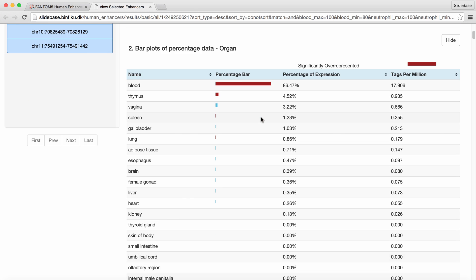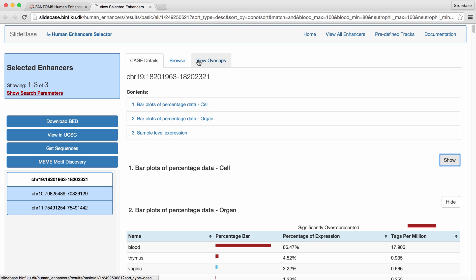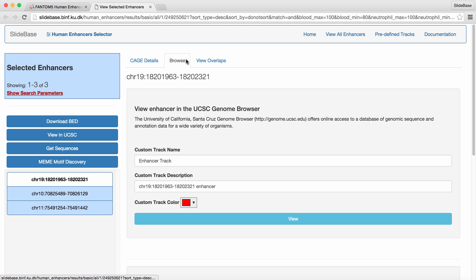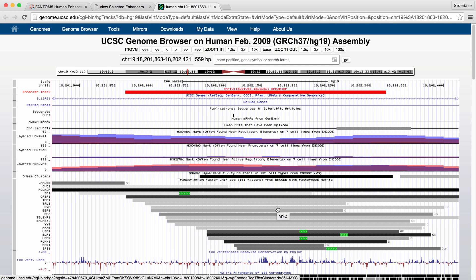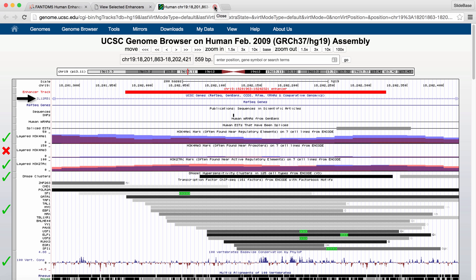In the second tab, we have the option of viewing our enhancer as a track in the UCSC Genome Browser. We will keep the default values for the enhancer track and click on the View button. In the UCSC Genome Browser, we recognise some of the enhancer properties: H3K4 monomethylation and H3K27 acetylation marks, but not H3K4 trimethylation marks; DNase sensitivity; a number of ChIP transcription factor peaks; and it is also slightly conserved. Since we are looking at Phantom 5 enhancers, they have already been defined to have bidirectional CAGE peaks. In addition, the enhancer is located on the intron of the IL12RB1 gene that binds interleukin-12, which is part of the immune response. This is consistent with our search including blood tissue and neutrophils, as the enhancer was expressed in a number of different white blood cells.